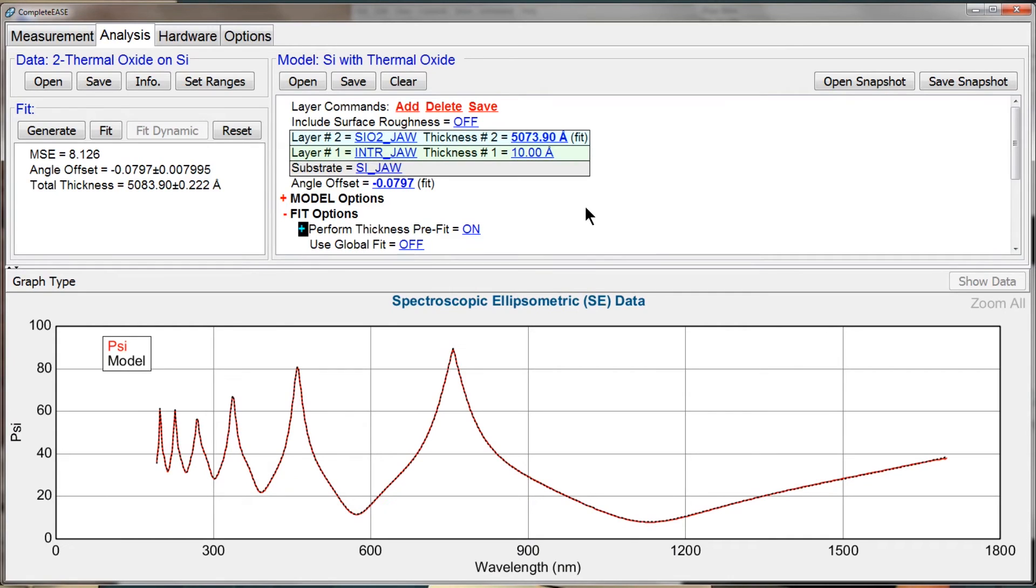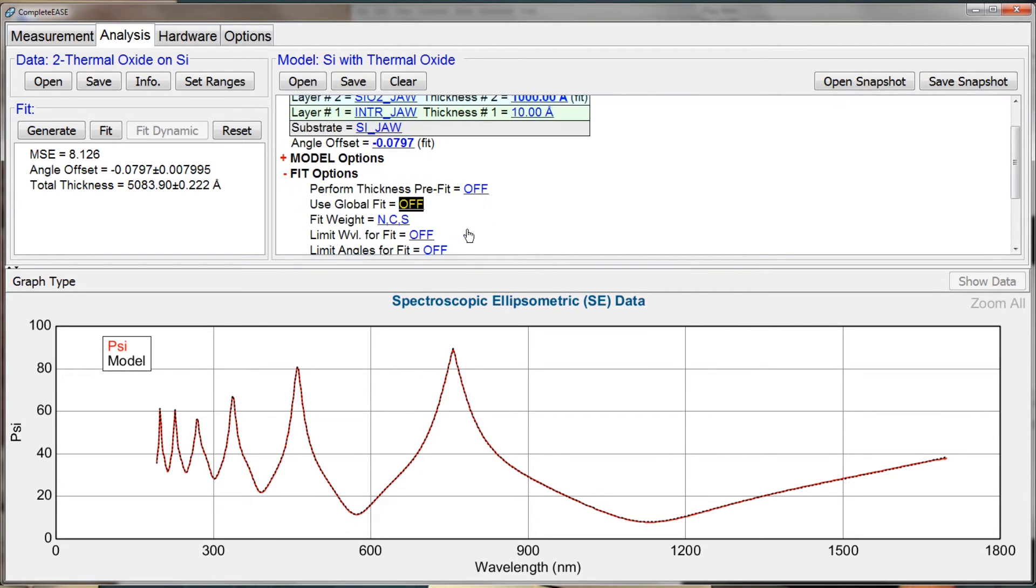Now there's another way that we could have found that answer. Let me go back to the wrong answer, 1,000. Turn off the thickness pre-fit so that you can see that it no longer works from the incorrect result.